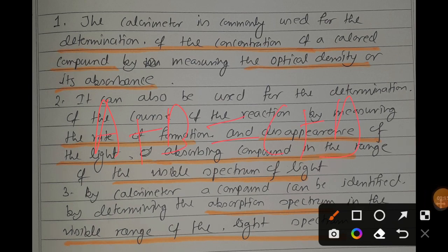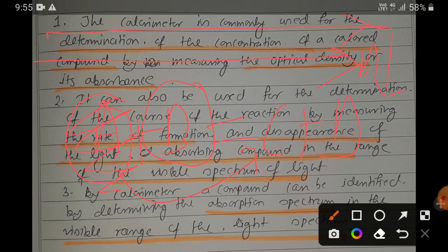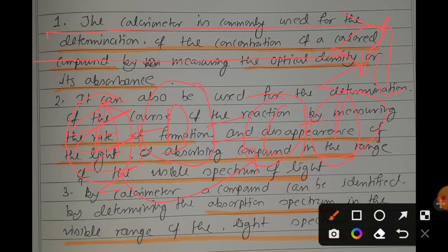when we pass visible light of appropriate wavelength, let's say specific for A, then if the reaction is going on, after some time we will find that absorption is getting lowered, right? Why? Because A is being used up and that is why C is formed, right? And then we pass a light ray specific for B, we will observe the similar thing because B is also used up, A and B together reacting with each other to form C and D, right?